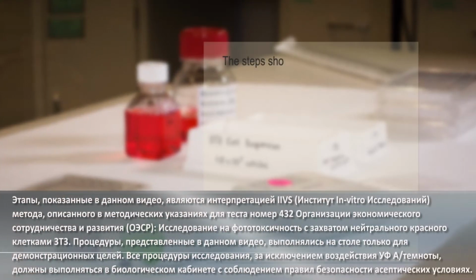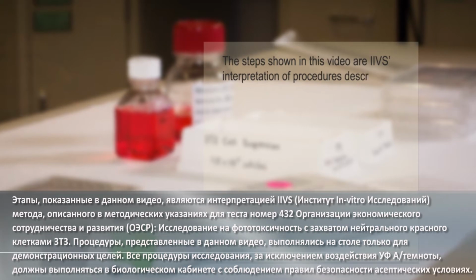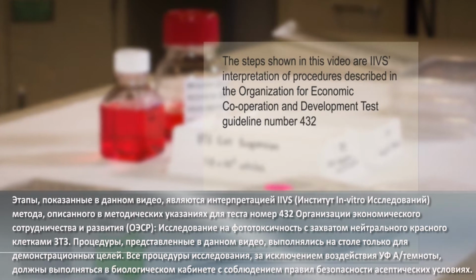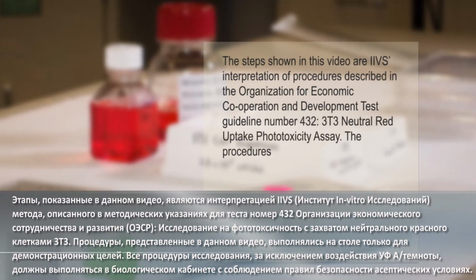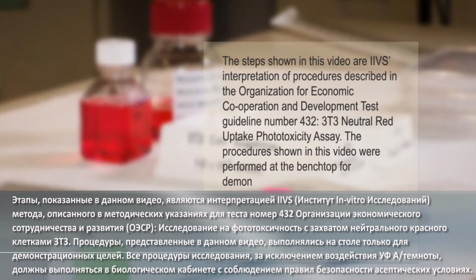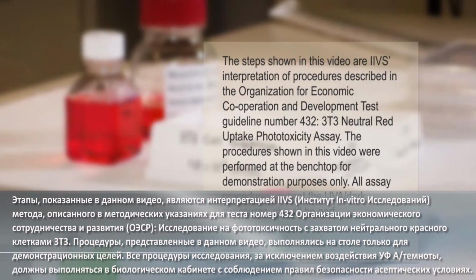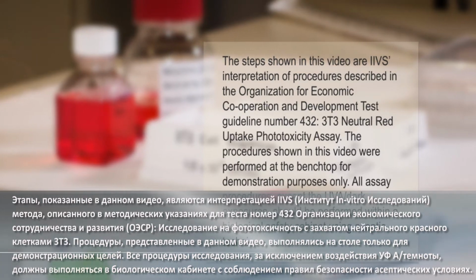The steps shown in this video are IIVS's interpretation of procedures described in the Organization for Economic Cooperation and Development Test Guideline number 432, 3T3 neutral red uptake phototoxicity assay. The procedures shown in this video were performed at the benchtop for demonstration purposes only. All assay procedures except the UVA dark exposure should be performed within a biological safety cabinet using aseptic techniques.